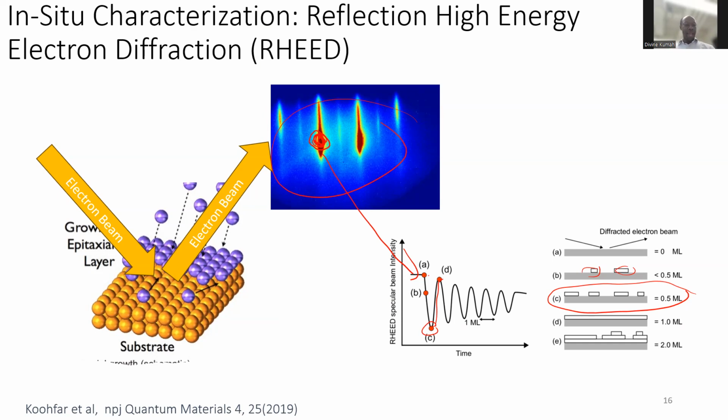The spacings of these atoms also tell us something. If I measure the spacing between these peaks, it's inversely proportional to the spacings of the atomic layers on my surface. So using this electron diffraction technique, I can also tell during the growth the spacings of my atoms and the kind of symmetry they have. And it also allows me to control things like the substrate temperature and the growth rates to get the right atomic spacings and atomic symmetries which are desired.